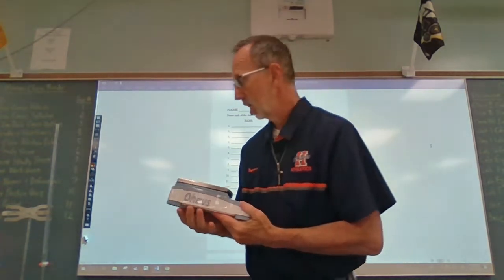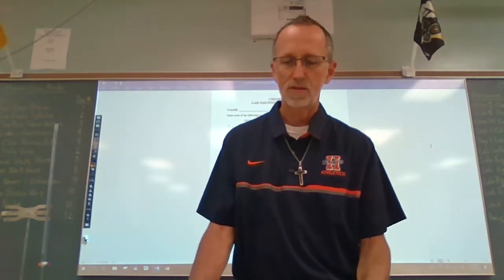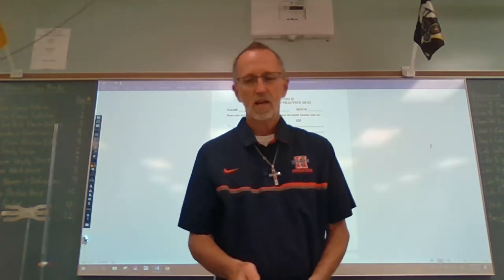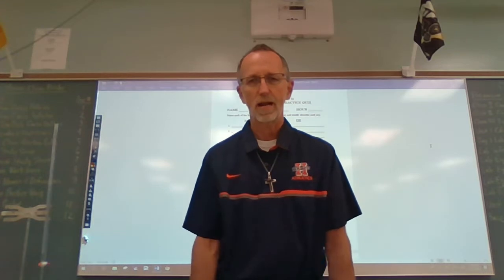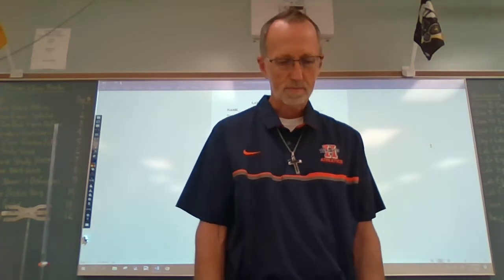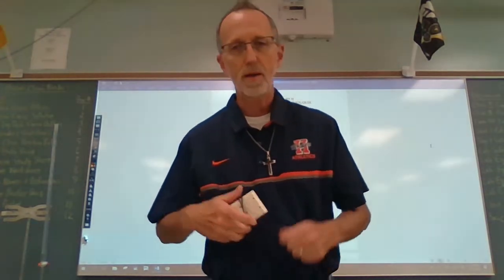Not weight, mass. And back in the old days, when we didn't have electronic balances, we had the old triple beam balance. You've probably seen one of those. You put your stuff over here, and then you've got slide bars here, 2 or 3 different ones, and you're going back and forth, and yeah, it took 5 minutes to find the mass of something. And here it takes about 2 seconds, maybe 3 seconds at most. So love the electronic balance. It measures mass.